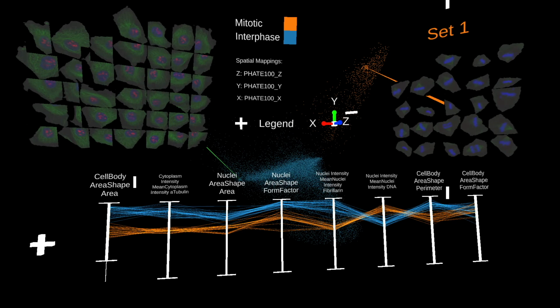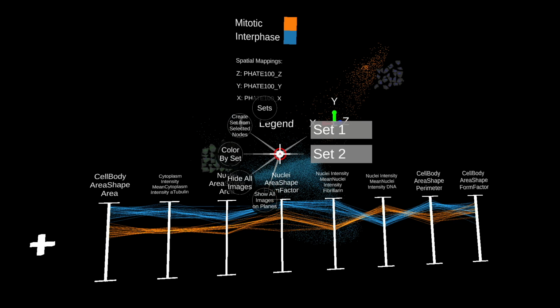So here biological experts can leverage their visual familiarity of cellular processes to map that understanding into the less familiar statistical space. Now, this is an intuitive process that allows us to understand some really quite complex data in a comprehensive and really rapid way.